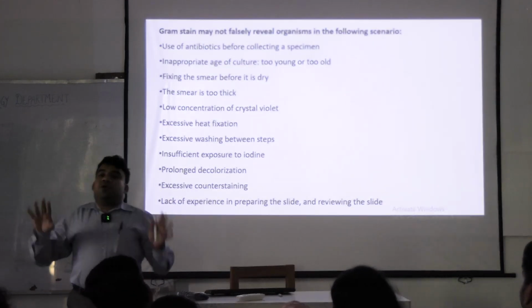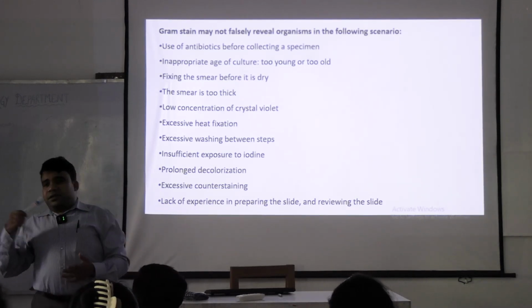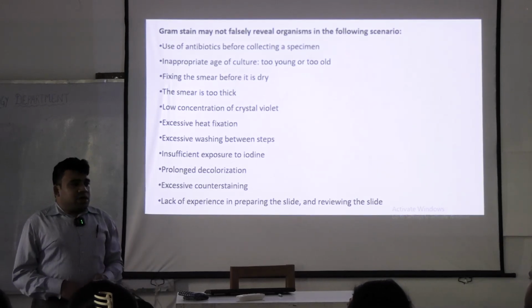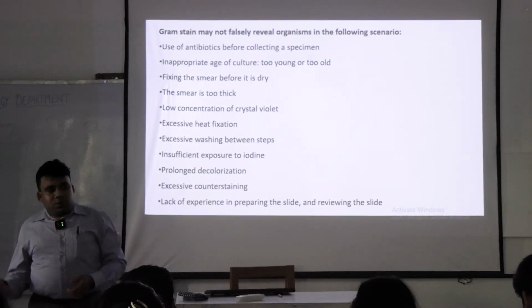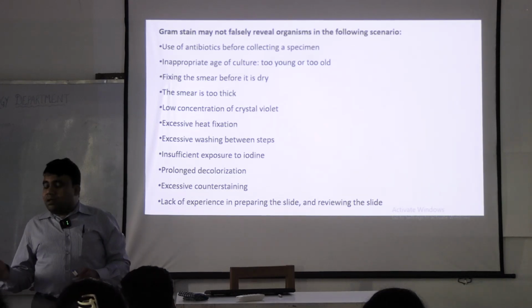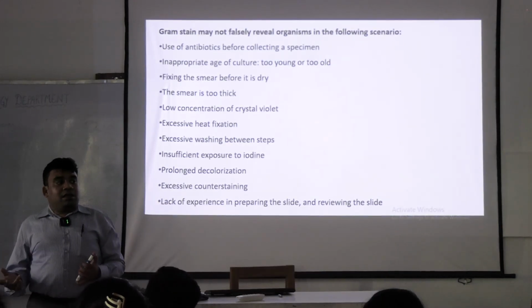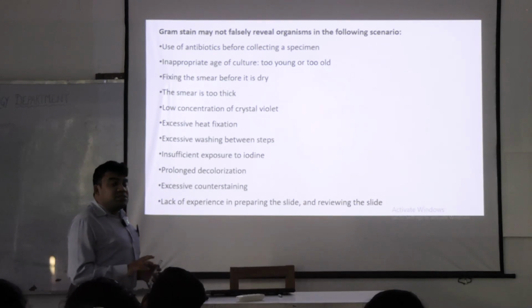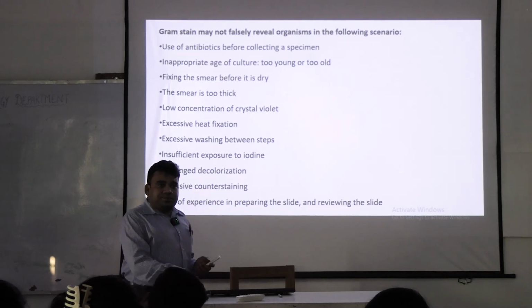So these are the predominant ways by which organisms are classified. It could be gram positive cocci in groups or clusters, Staphylococcus, gram positive cocci in pairs, Diplococci, gram positive cocci in chains, Streptococci, gram positive bacilli in branching pattern, gram negative cocci, gram negative coccobacilli, gram-negative bacilli and gram-negative curved bacilli. So all the pathogenic bacteria, pathogenic means causing human disease, are classified in this way.